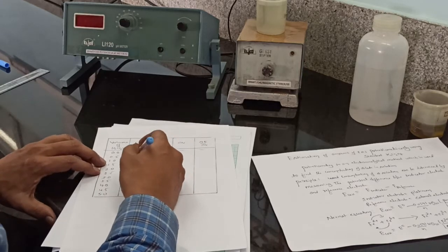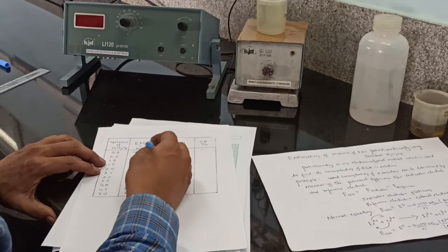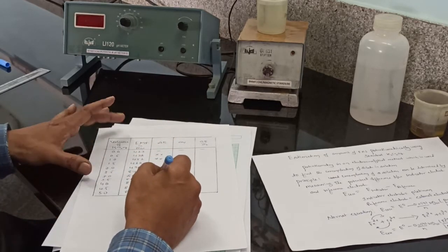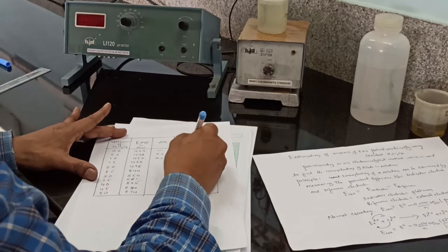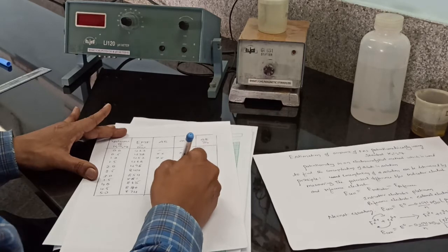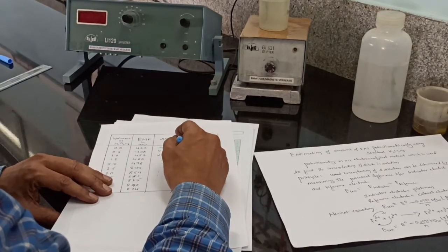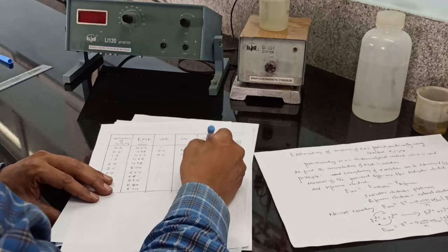At 1, the difference of EMF is 452 minus 438. So like this we have to calculate the change in EMF. The change in volume is 0.5, since in each step we add an increment of 0.5 ml. Then divide delta E by delta V, we will get values for this term.